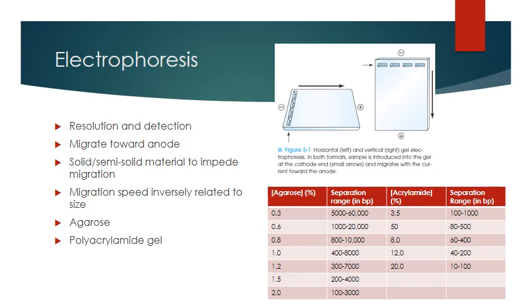One of the other things that you're going to have to do is you don't necessarily want to test the entire genome, okay? Or if it's proteins, you don't want to test every single protein. So one of the things that you're going to do is resolve, which means be able to focus on, right? Resolve all of the materials that you have or separate them according to their similarities, either by size or charge. And one of the methods that we do this is electrophoresis, okay?